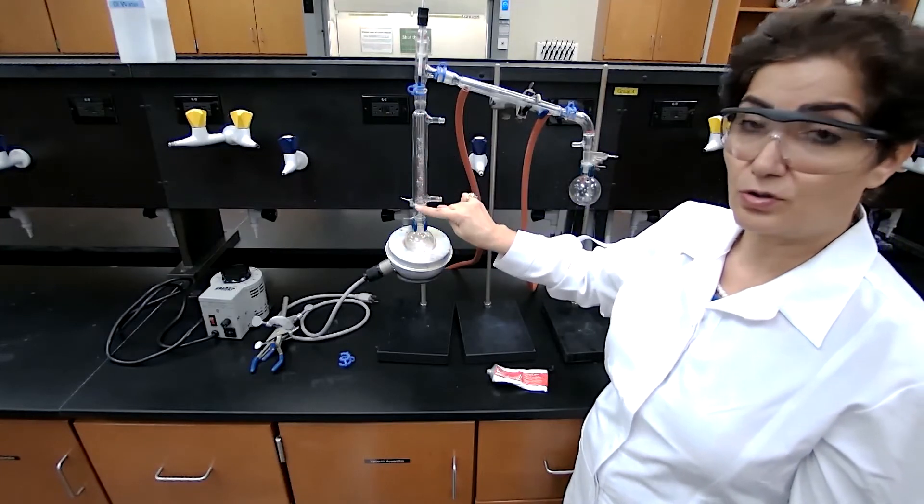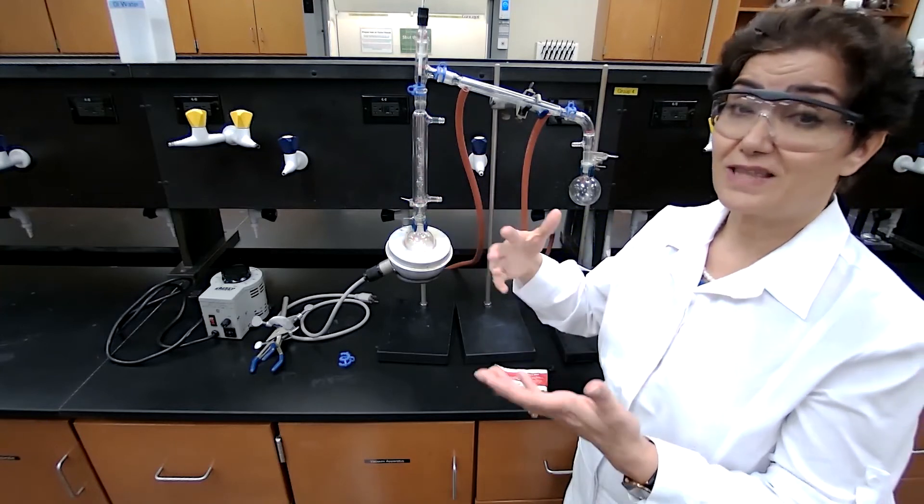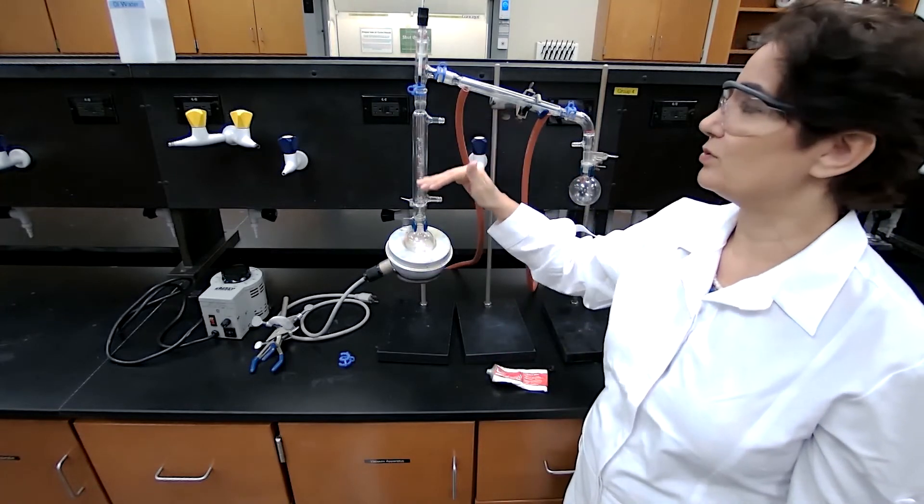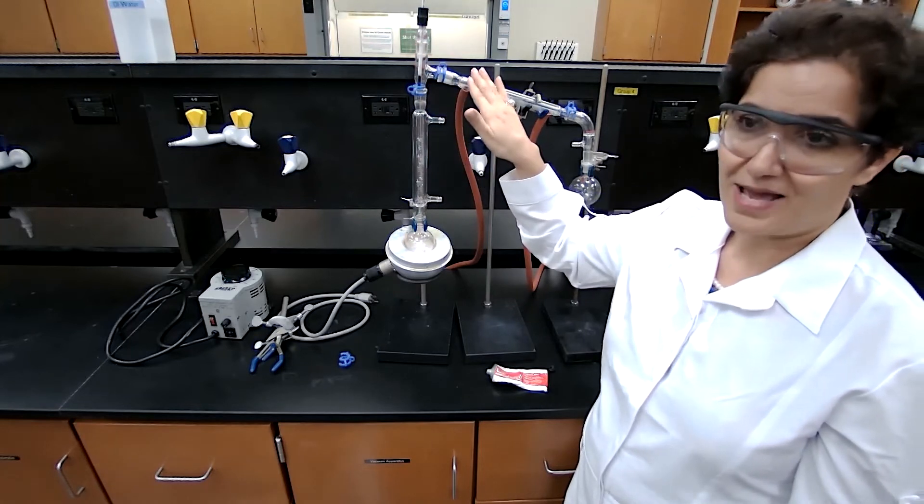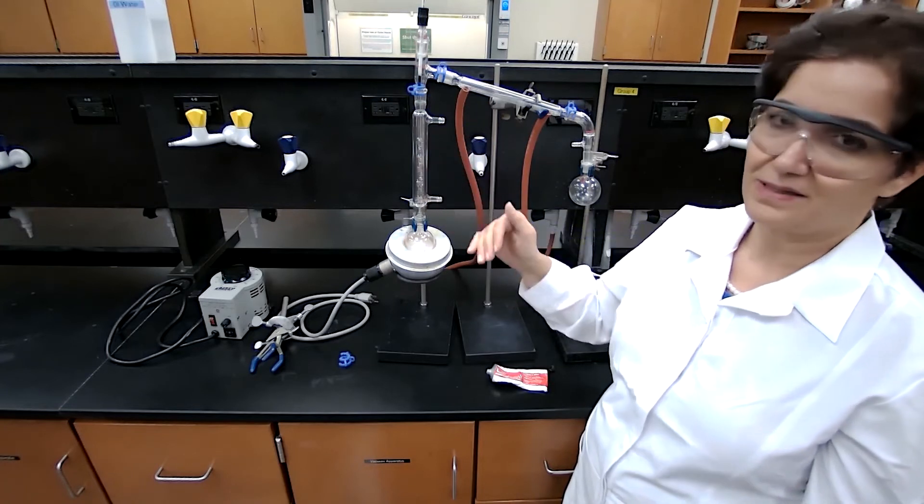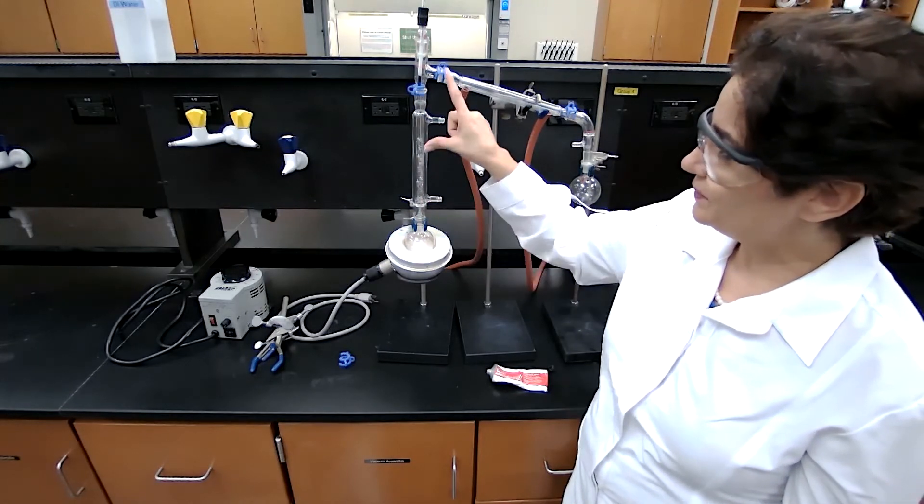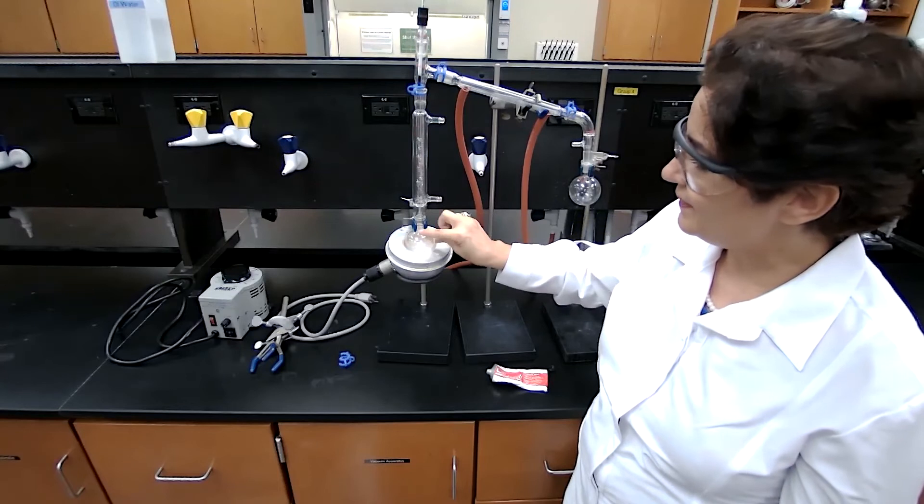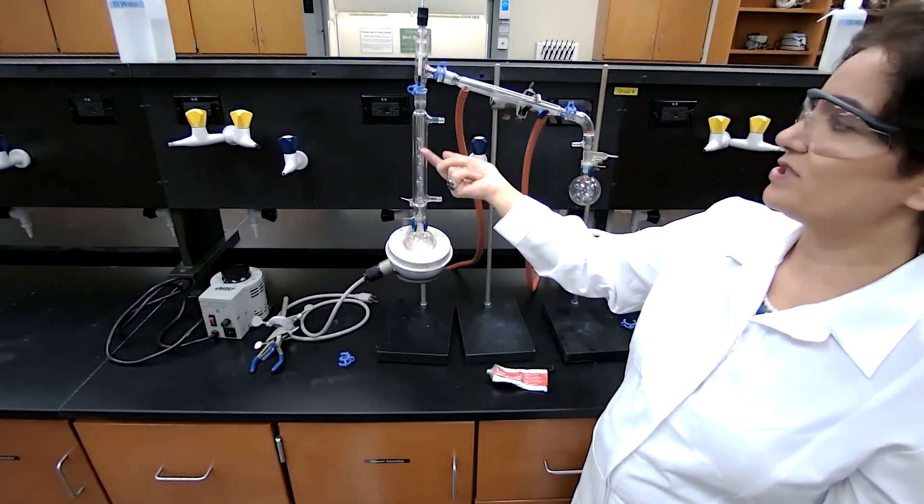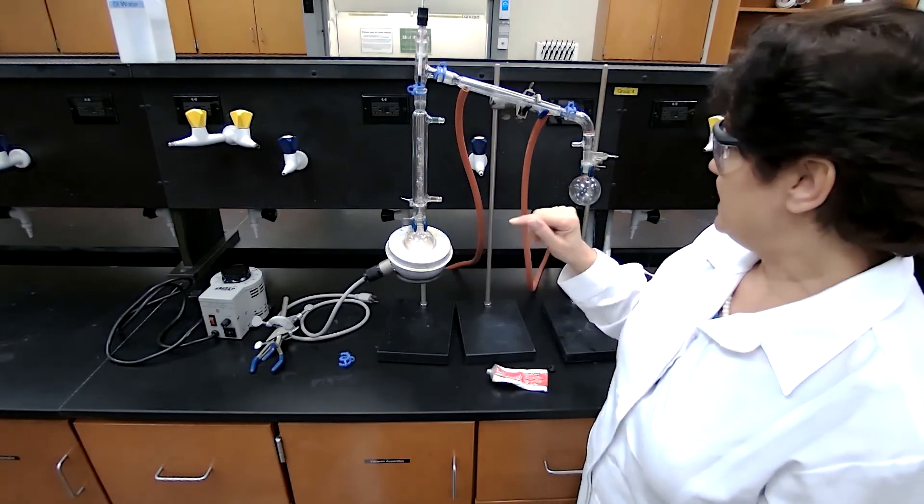As both compounds A and B are going through the fractionating column, the fractionating column is going to fractionate them - it's going to discriminate them. It's going to allow only the compound with lower boiling point to reach the distillation head and not the other one. That's the benefit and the difference between the fractionating column and simple distillation. For simple distillation you don't have this - vapors are generated and they go into the condenser. Fractional distillation returns the one with the high boiling point. Thank you.